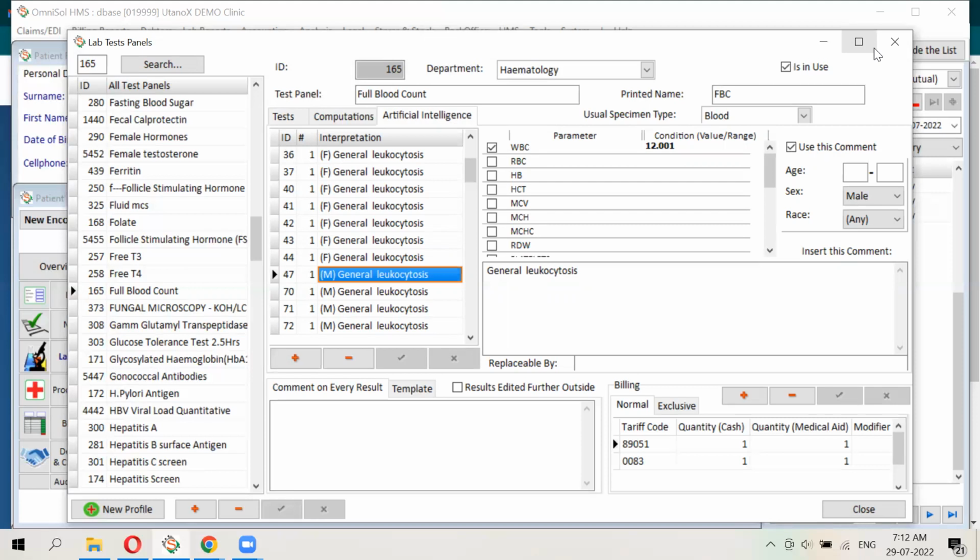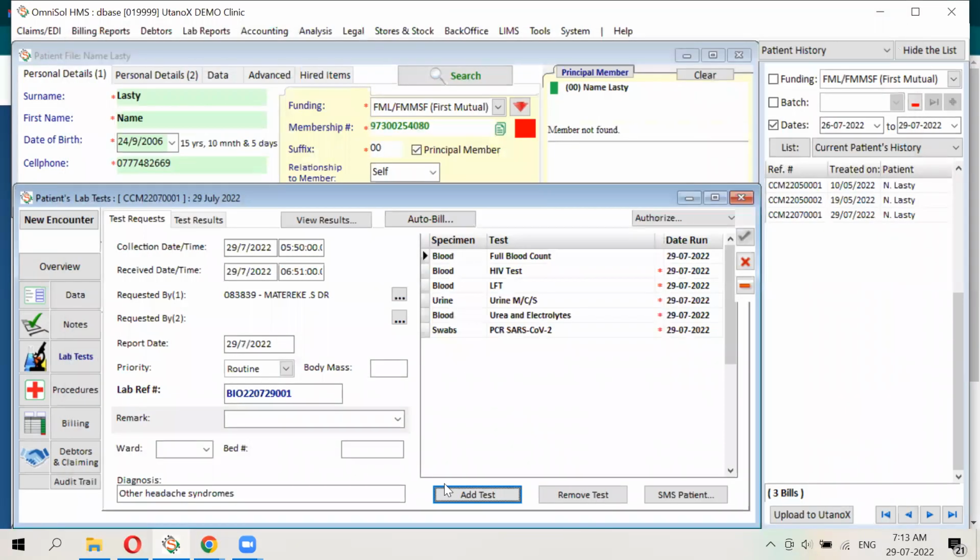Okay. Questions? Okay. Here, yeah, I think we were on adding the test, adding the patient, which is pretty much general, yes. Very good, very good.